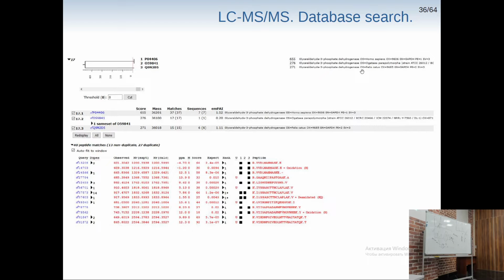A small amount of dog or cat keratin can get into your experiment. So you should look at the intensities. The funny thing is that in our laboratory there is one person who doesn't have any house pets.